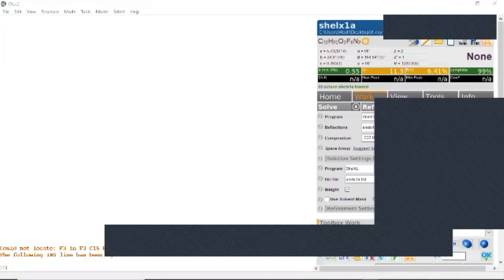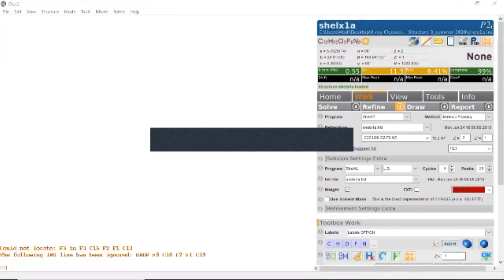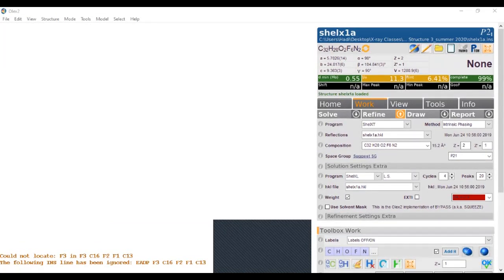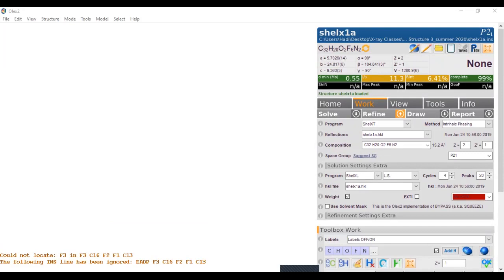Today we'll be looking at in-class structure 3. I'm going to bring that up in Olex. I've opened up the INS file. This compound is an N-oxide compound synthesized by Dr. Lernoff's group, and it contains nitrogen, oxygen, carbon, and fluorine as the atom types.